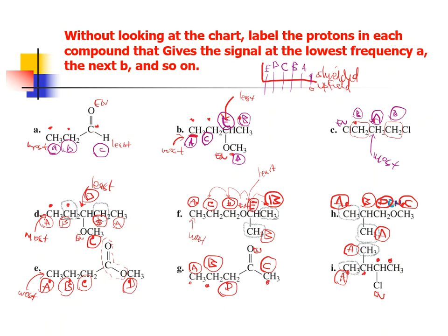All right, so what's next in line? Well, here is the carbon, and one to the left and one to the right. The one to the left has 1 hydrogen on it. The one to the right has 3 hydrogens on it. That carbon can't beat up the hydrogens and take as much lunch money as this carbon that only has 1 hydrogen to deal with, right? It has a much easier time handling that 1 hydrogen than 3. So that means that this will come next, and that will be our B signal. And that means that this will come next, and that will be our C signal.